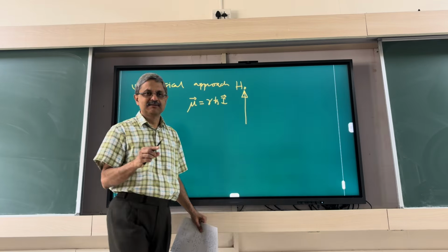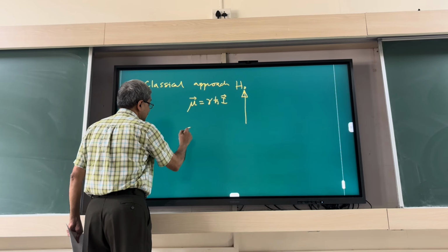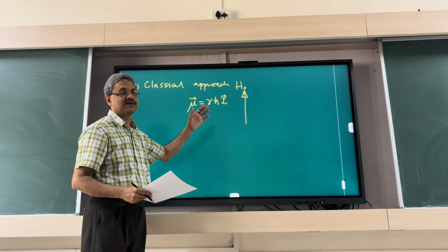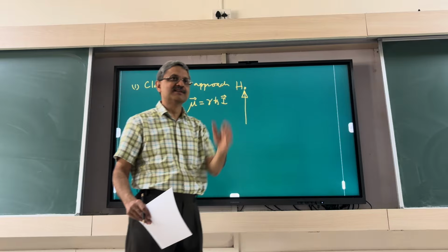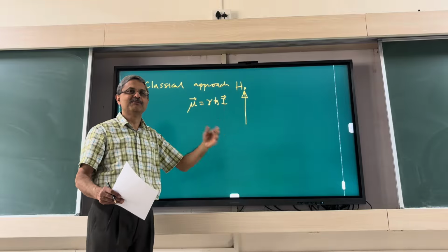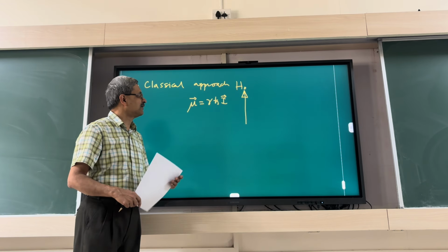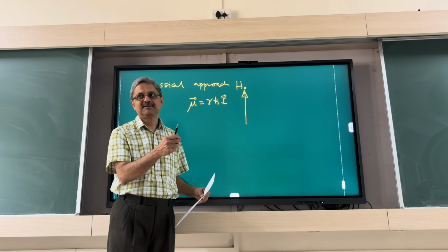So what are the dynamics? So again, I'll write the answer already. If you have a magnetic field, then there is a torque exerted on the moment. Gyroscopic motion, that's the correct name for it. So this is like a gyroscope, a nuclear moment, but it's like a gyroscope, right? So a spinning top is a gyroscope. So you want to know, these are all fixed in space. Okay, so there is a torque on it.